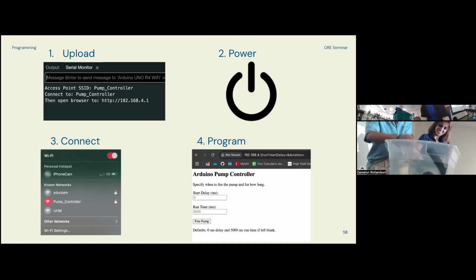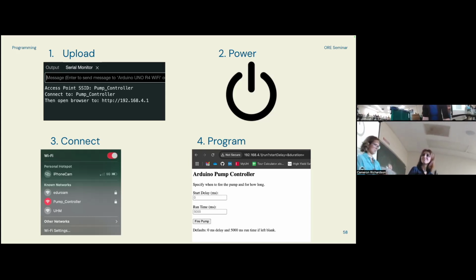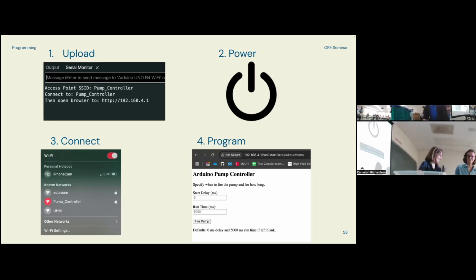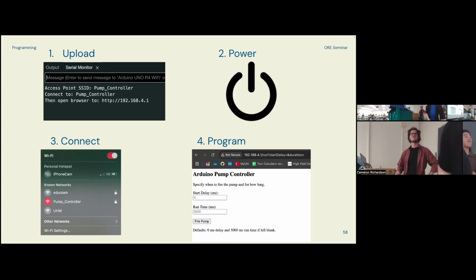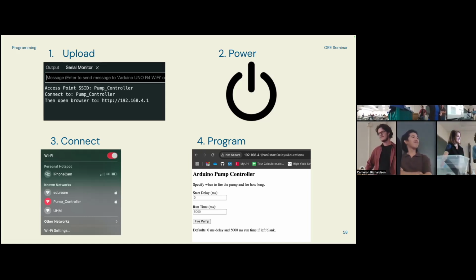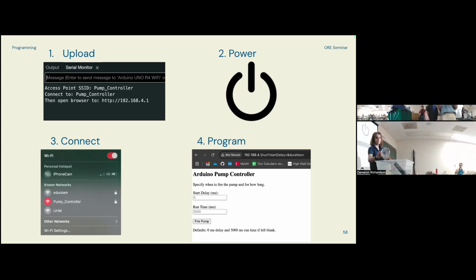Okay, this is our first sample. You still see a nice full bag. That was user error, I clicked the button twice. That's a water sample, 1 liter. Just set it there. Okay, well, we gotta show another one for redemption. I think we're gonna do it into the beaker.